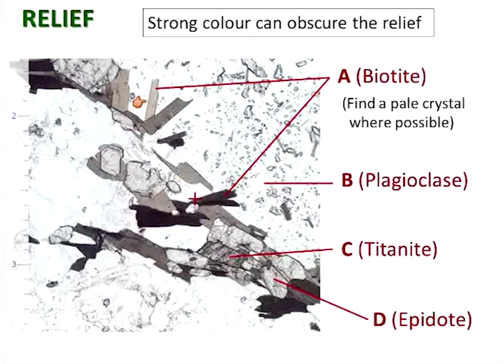So I hope everyone can see and is happy with this sort of order here that I've got. You've got the titanite, which is the highest relief. You can see it looks a little more mottled and darker, and it stands out even from the less high relief one behind it, which is the next one. That is epidote, which looks slightly clearer, slightly less grey. And then we go down through the biotites in various orientations, and eventually to the ground mass, which is plagioclase.